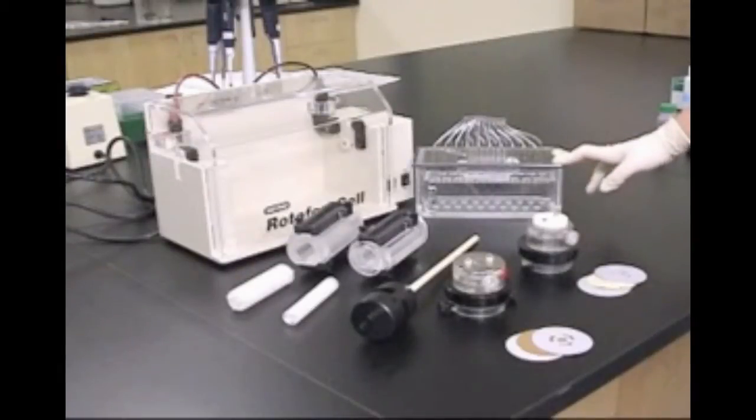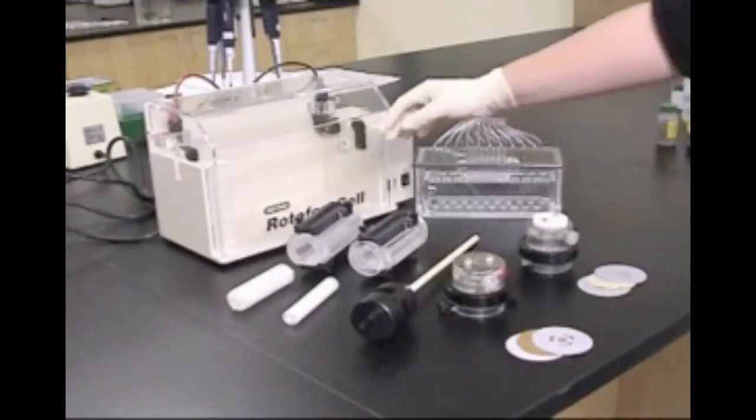The harvesting apparatus, which works with the house vacuum to collect fractions into test tubes once separation is complete.